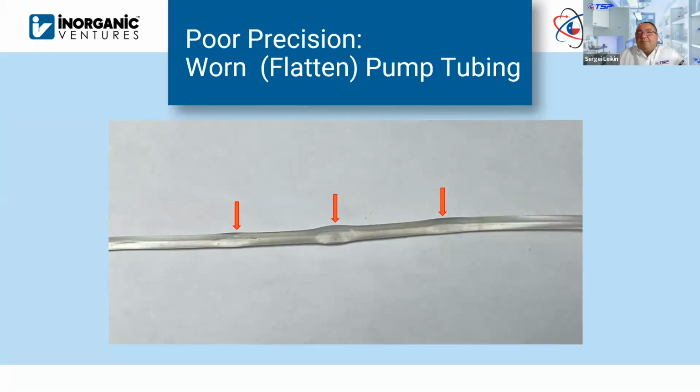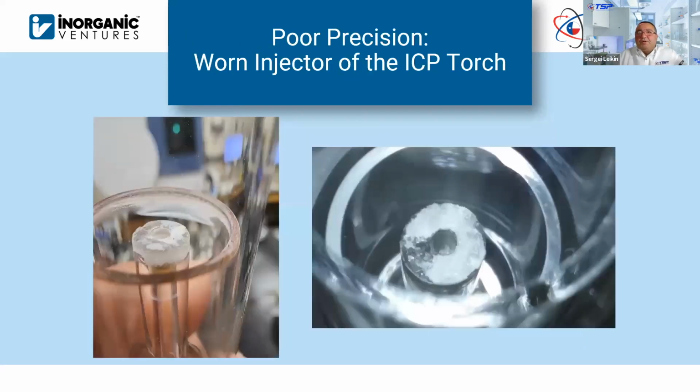And plus, additionally, as I mentioned, the way you tighten the clamp on the pump. Even if the tubing is good, and also should be stretchable, that's another parameter. Even with good tubing, if the clamp is over-tightened, your precision may also suffer.